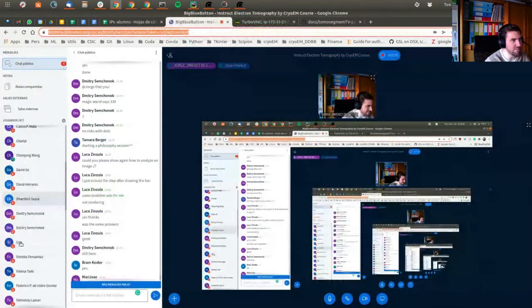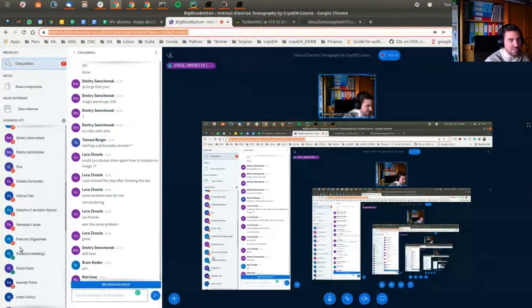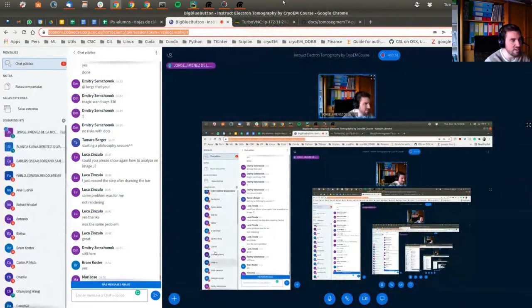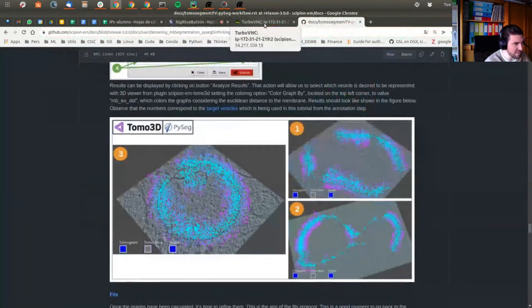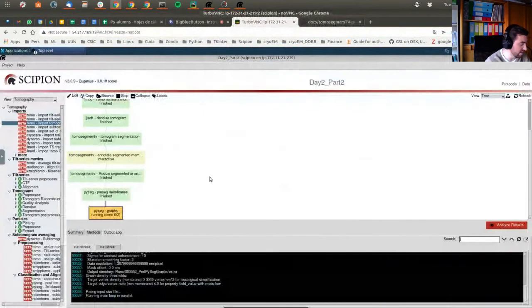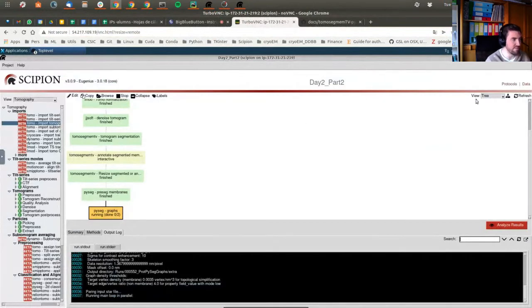Okay, I was going to mute him or her. So I'm afraid that these hard disks, as said before, aren't SSD. So it seems that the writing time is taking so long. I expect it not to be so long from this moment, because it shouldn't be far from the end, I hope.